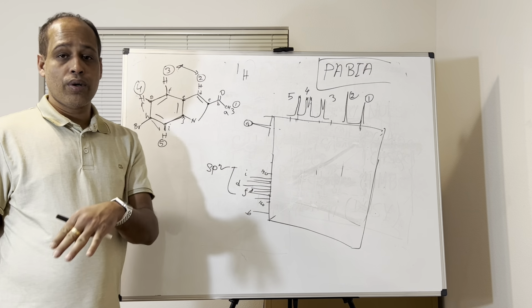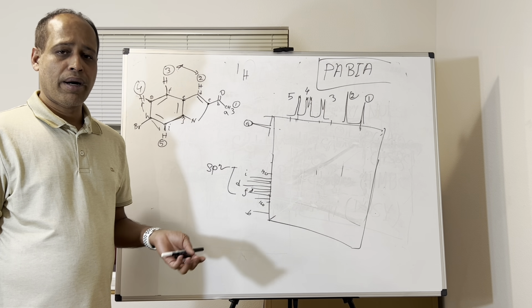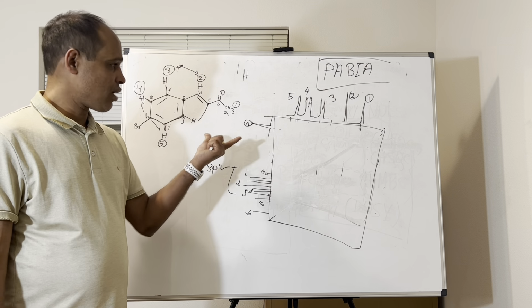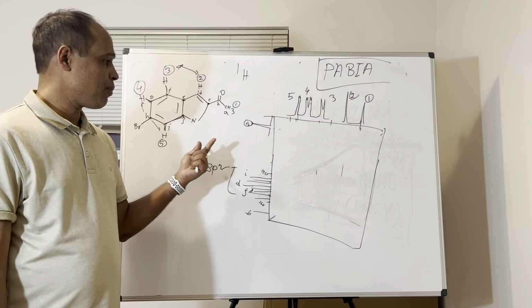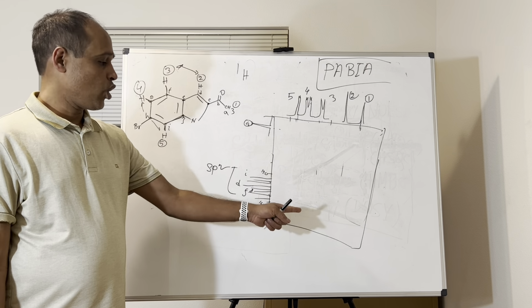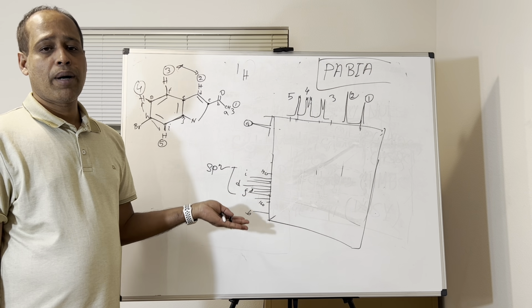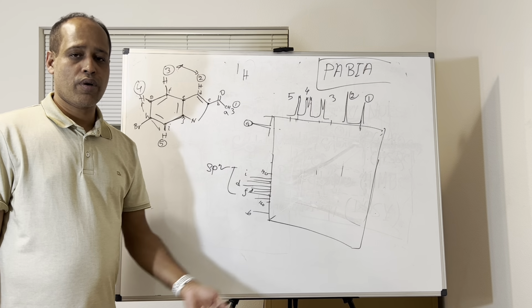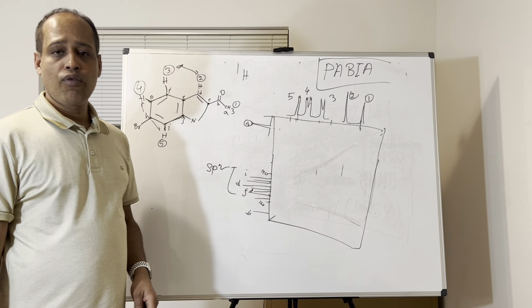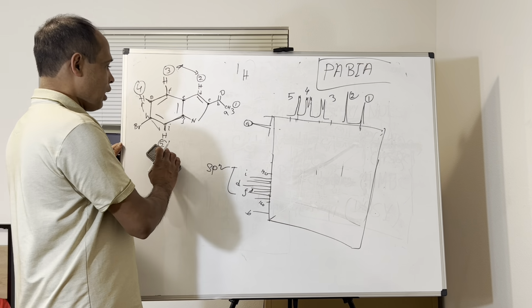So I'll show you the real structure example, how we normally correlate or determine that HMBC, because if I don't show you the real structure or application, you cannot understand here. But just get an idea, whatever carbon doesn't have the proton will not show in the HSQC. Definitely that can be determined or identified by HMBC. That will show a cross peak. I'll show you the real example with the spectroscopy, then you will understand. So hopefully till now 2D NMR is done, you understand the whole thing.